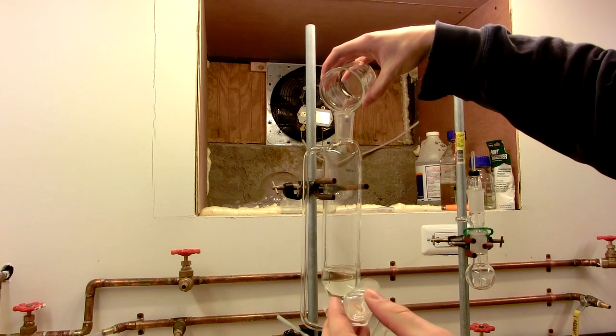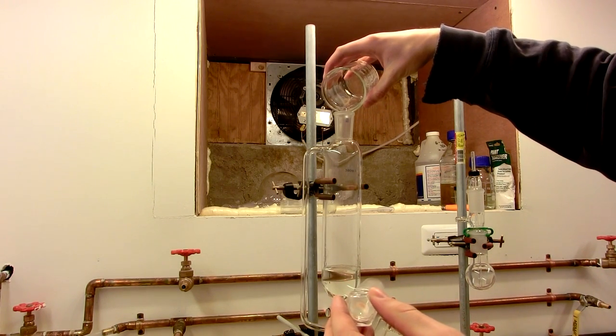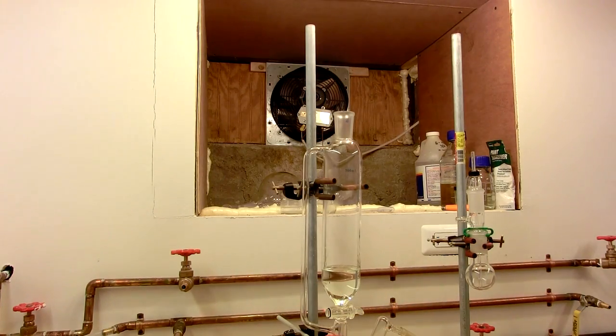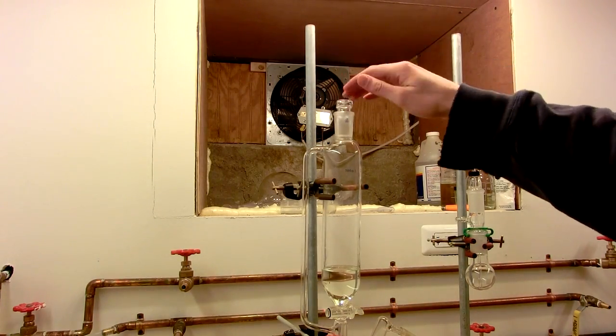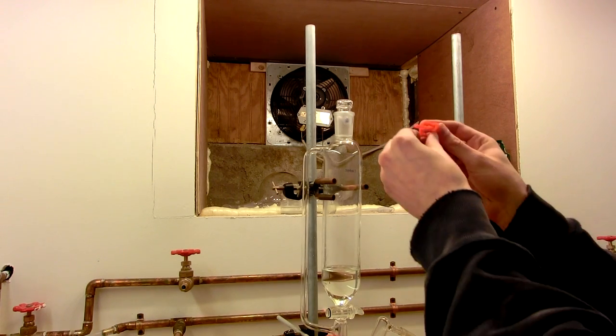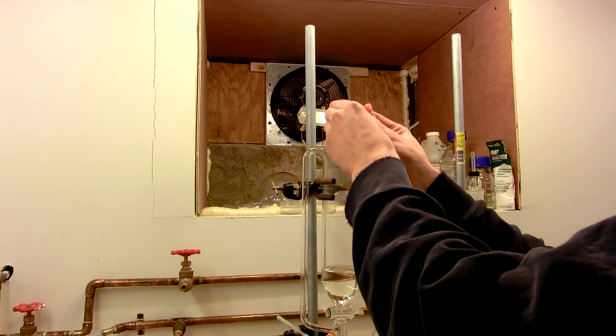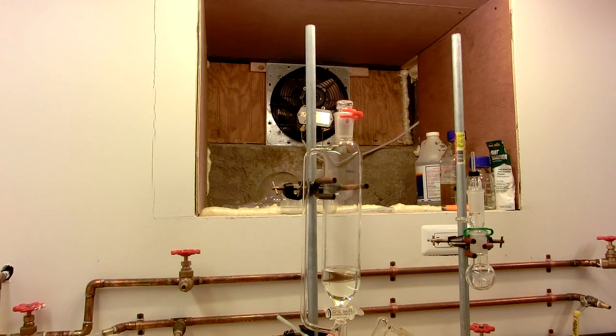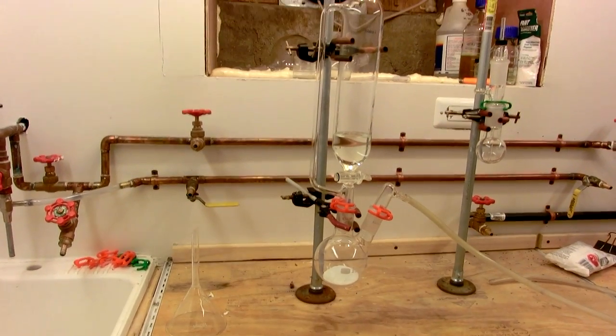You can see it's fuming in the water vapor that's in there. There we go. And insert the stopper. And because this apparatus will be pressurized, we also need to secure this with a clip. Perfect. Chlorine generator is now set up.